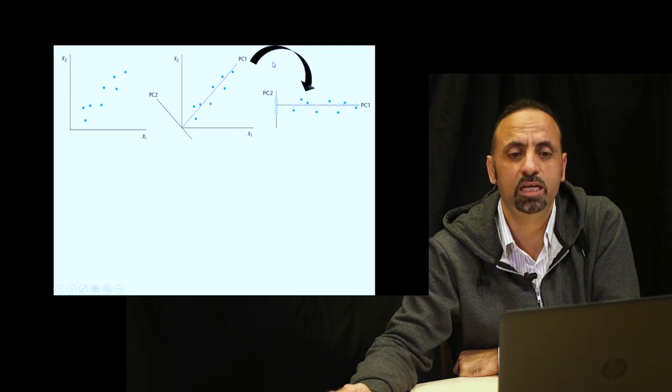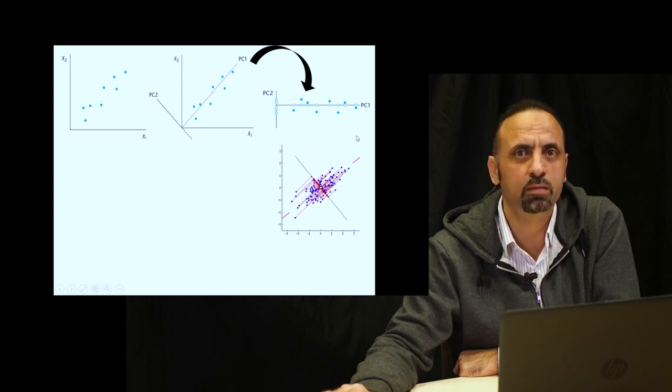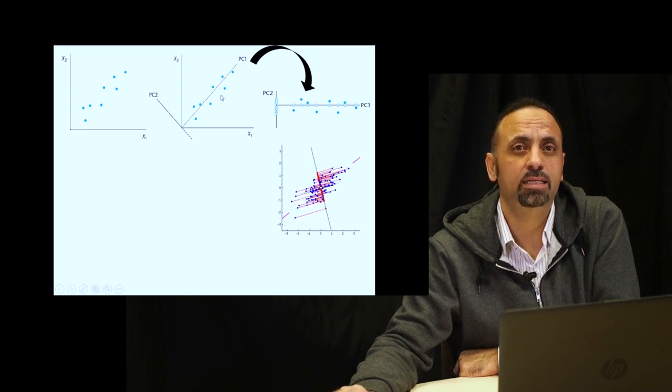That means we have to make a projection. If we project this data, you can see minimum values of error between the data point and my line. So you need to make this kind of rotation, and each time you calculate the projection and calculate the error, and the one that gives us the minimum error is the best one. And minimum error means it can carry a lot of variation, the maximum variation between all of your data.